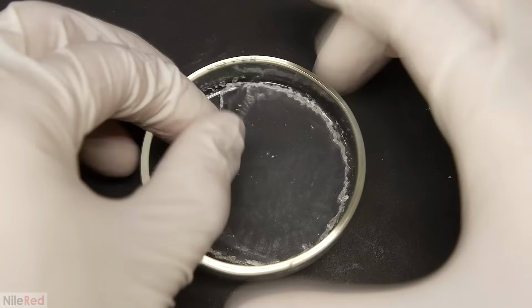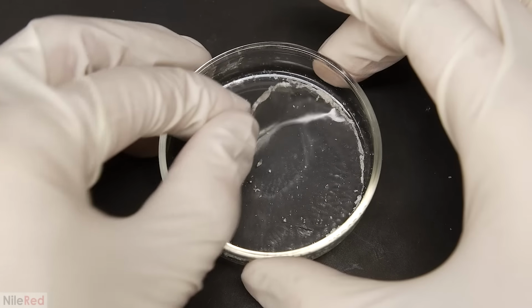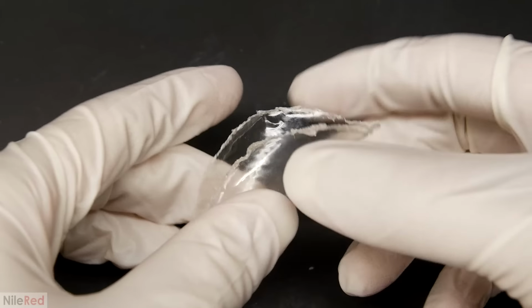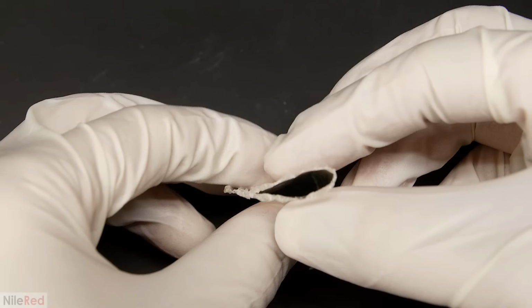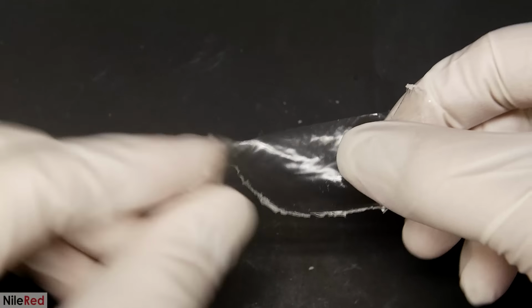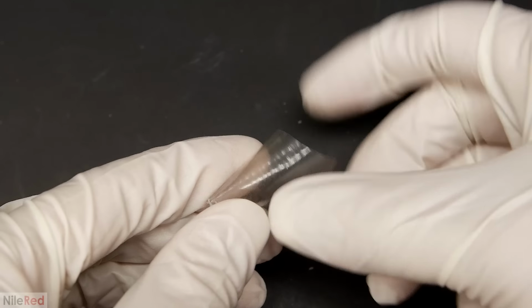I then did it again with a 20% mixture of triacetate, and I let it evaporate very slowly. The film it made was quite strong, and it seemed to be more flexible than the diacetate was. I think this film might have just been thinner though. Anyway, keep in mind that the stuff I'm using isn't super pure, and that the impurities might affect the final properties of the plastic.